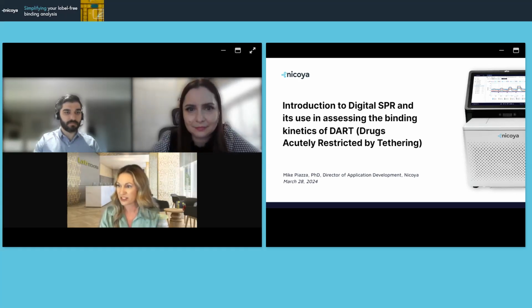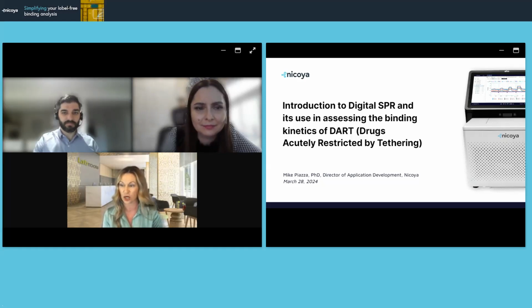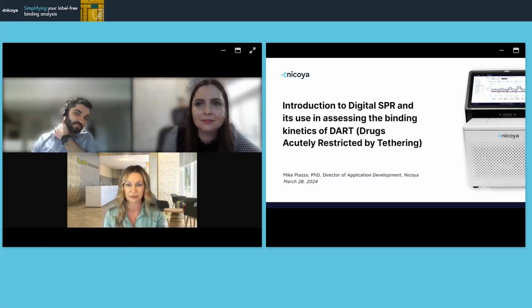So great. We have so many questions that have already come in. I'm just going to dive right in. Mike, Victoria, I'm going to ask them to both of you, so whoever wants to take it first, go ahead. I'm going to just start with this one right here. How does HaloTag target the cells of interest?